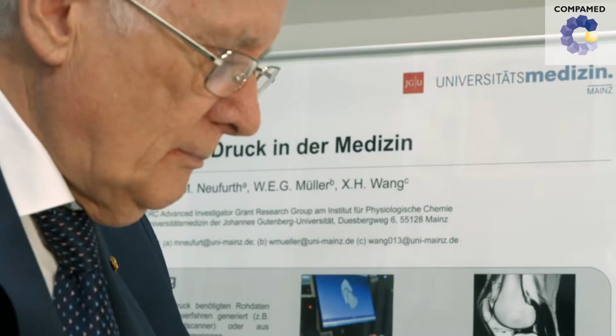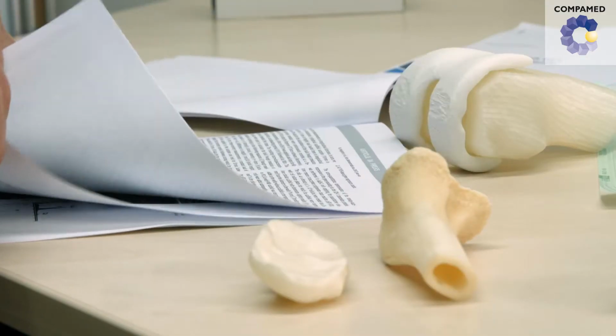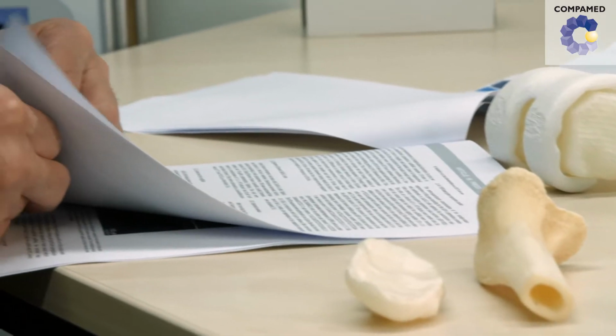Within the scope of BiomaTiCS, Professor Werner Muller and his team at the Institute of Physiological Chemistry concentrate on the bioprinting process. Bioprinting is a process that combines bioink, biocompatible ink, with cells to create tissue structures with the aid of the computer. This computer-controlled tissue structure subsequently has the custom fit you ultimately need to offset a bone defect or tissue disorder, for example.